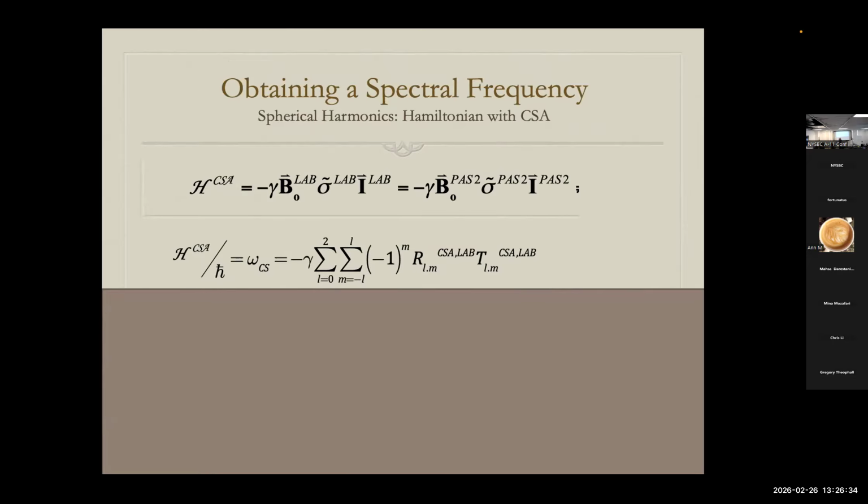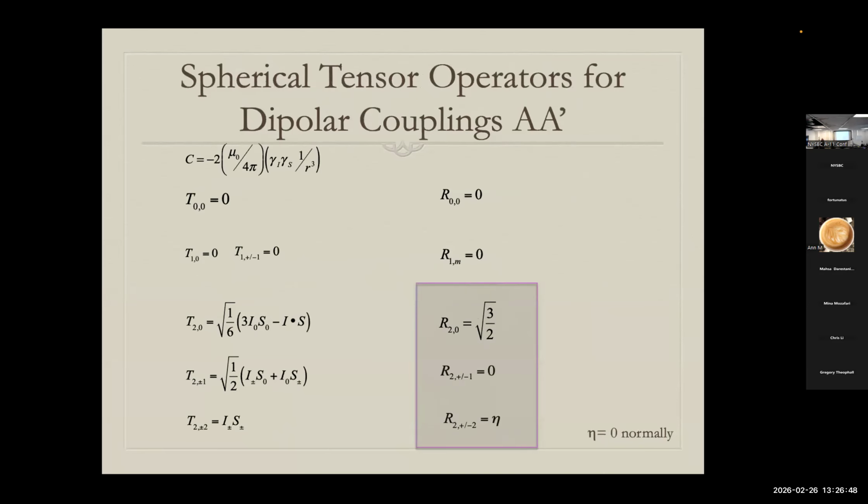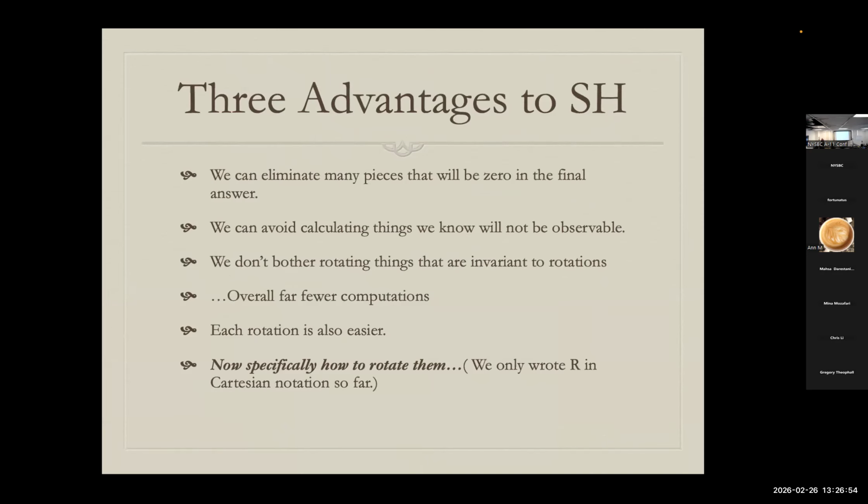I gave you the rules on another slide, how to pull those out, and now here I'm giving you what I believe the right answers are. These are all things you can also do. You understand what the definitions are, you should be able to reconfirm that this slide is correct. And here's a table of answers for the dipole. So these will help you work problems.